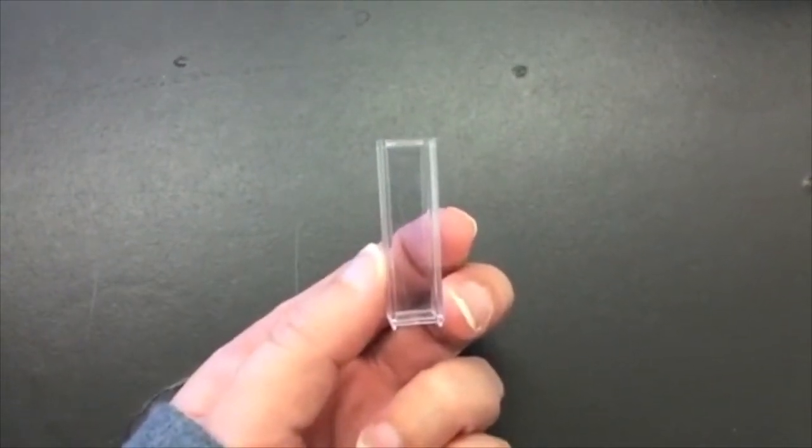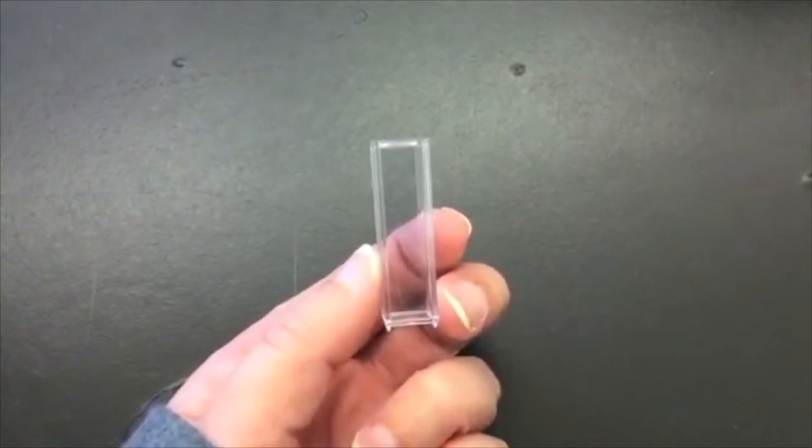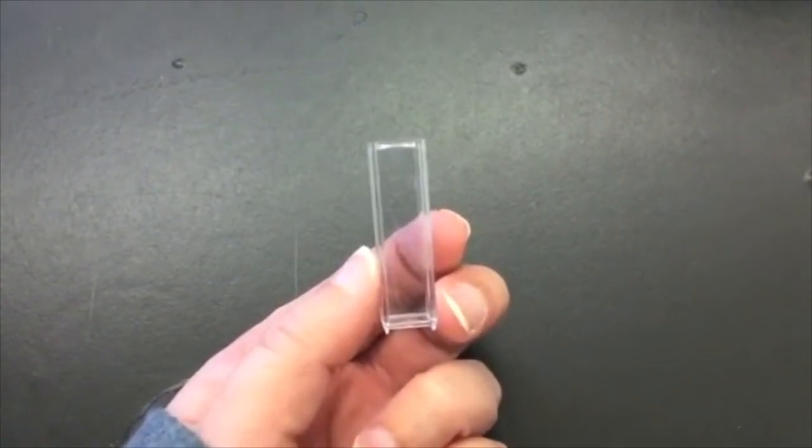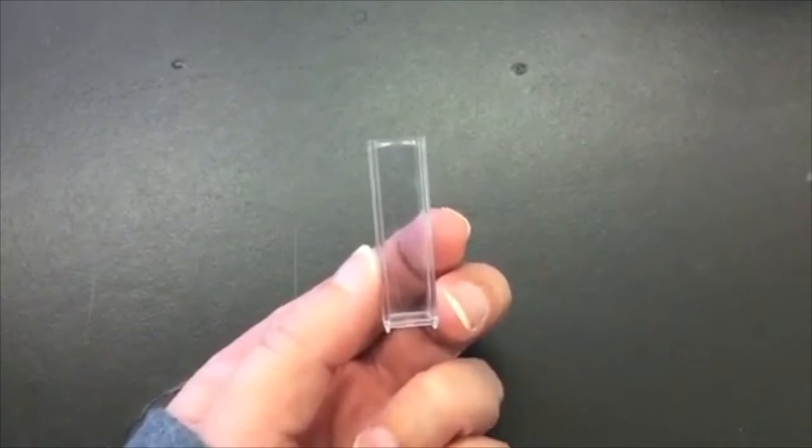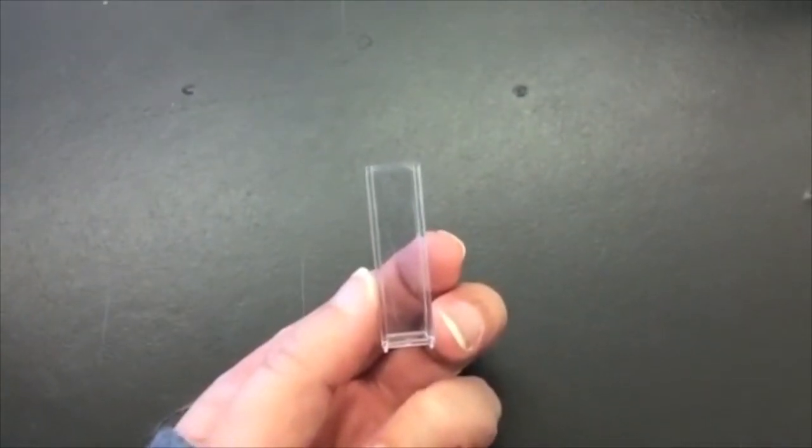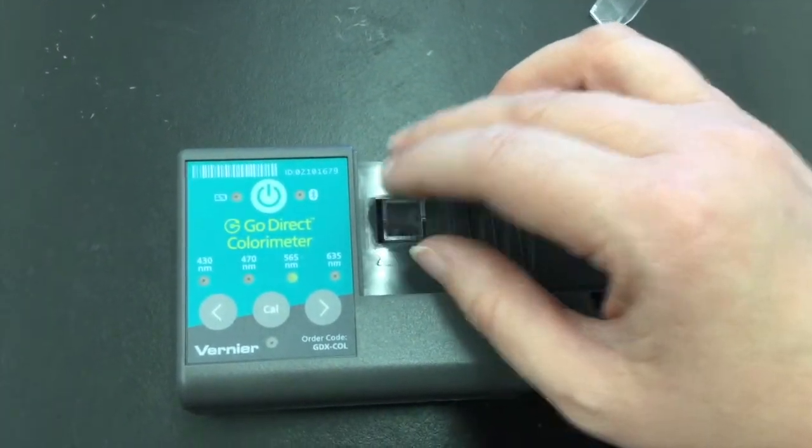Your lab manual refers to a reference mark. Sometimes you will see at the top of one of the edges a triangle. If not, just make sure that you face one of the clear sides towards the reference mark. We are going to put in distilled or deionized water for our calibration.